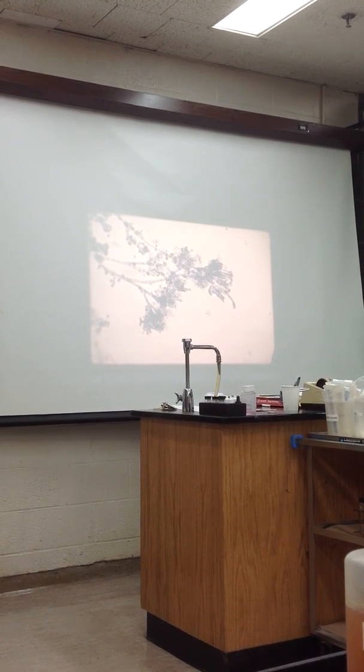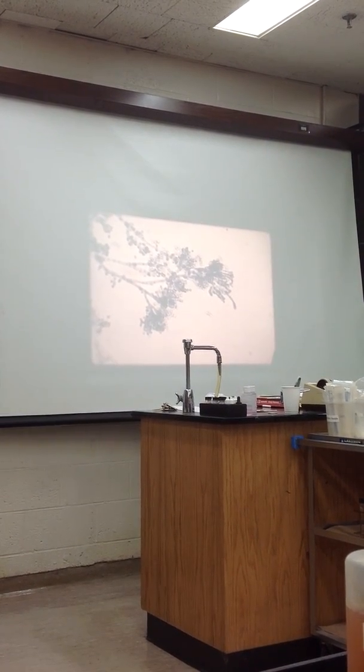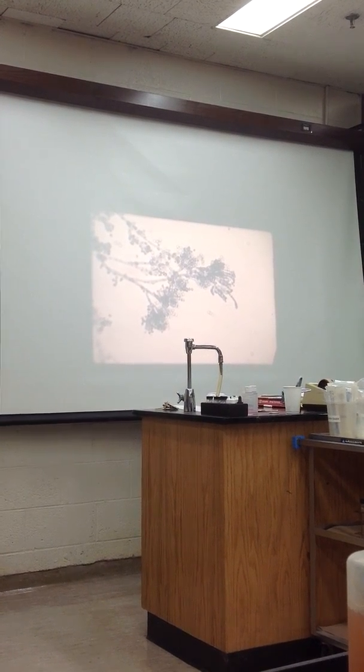Okay, Mr. V, identify that fungus. Septated, septated.